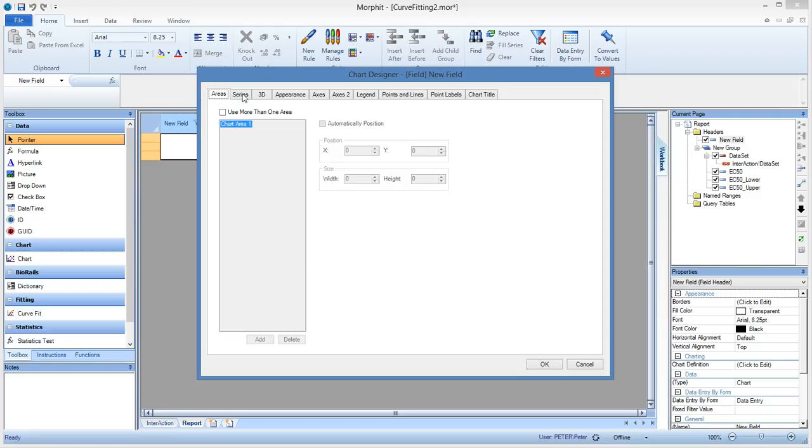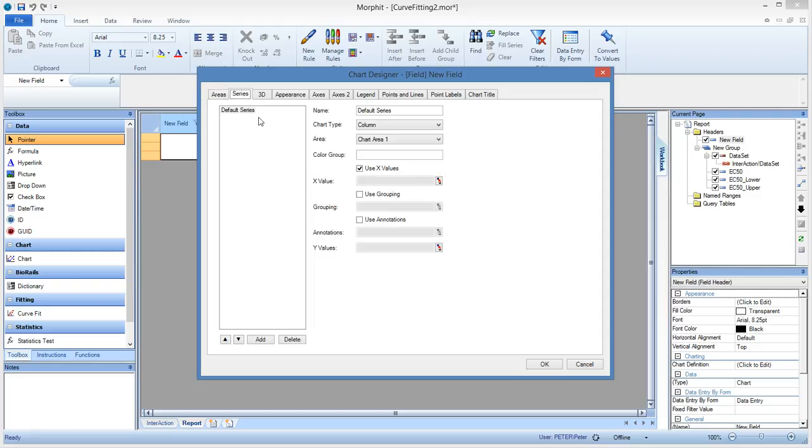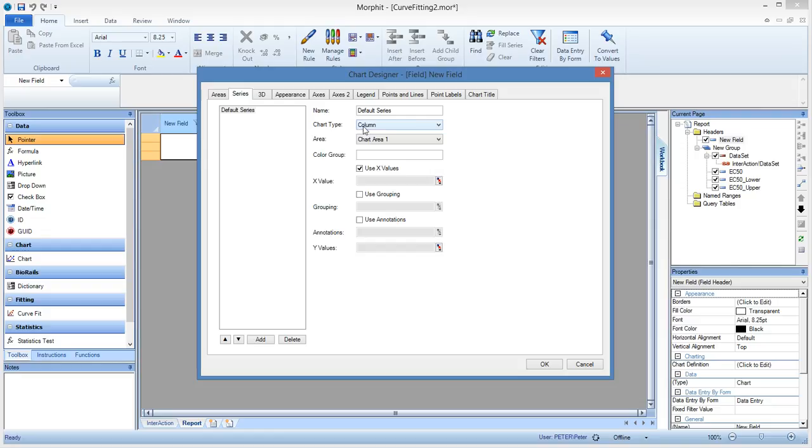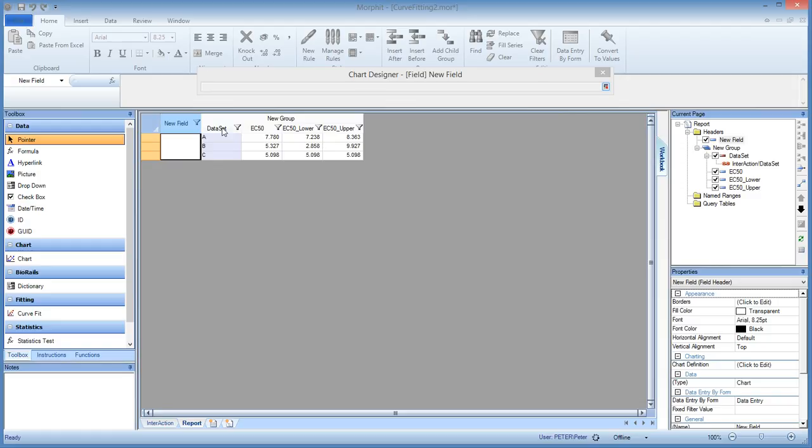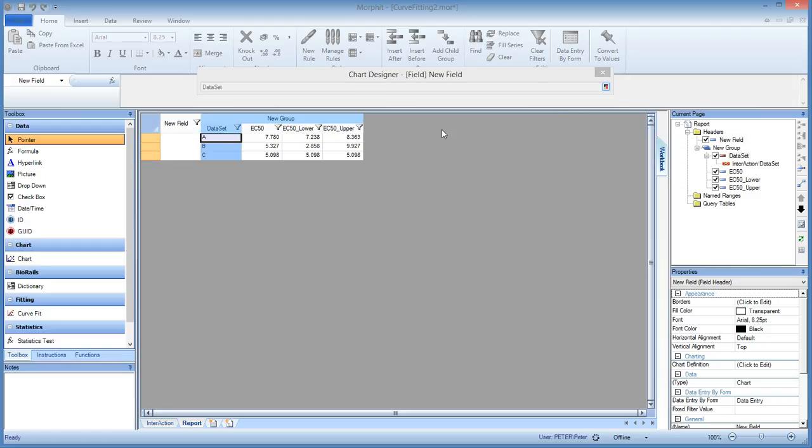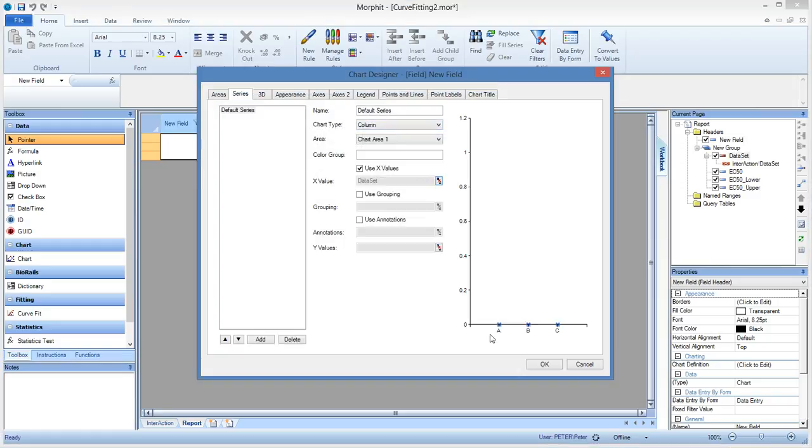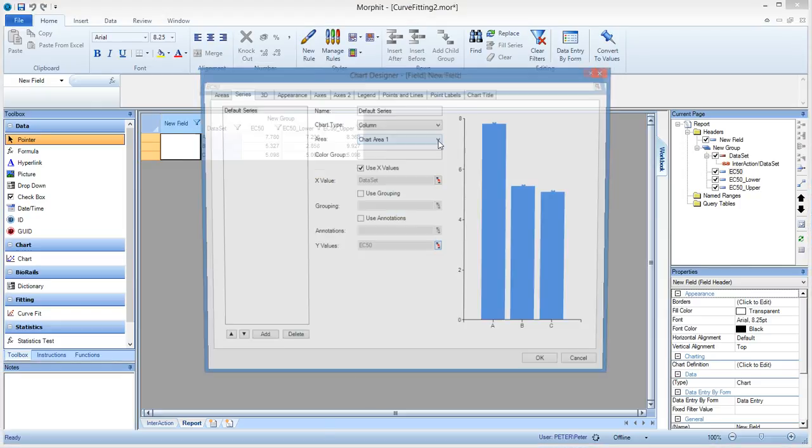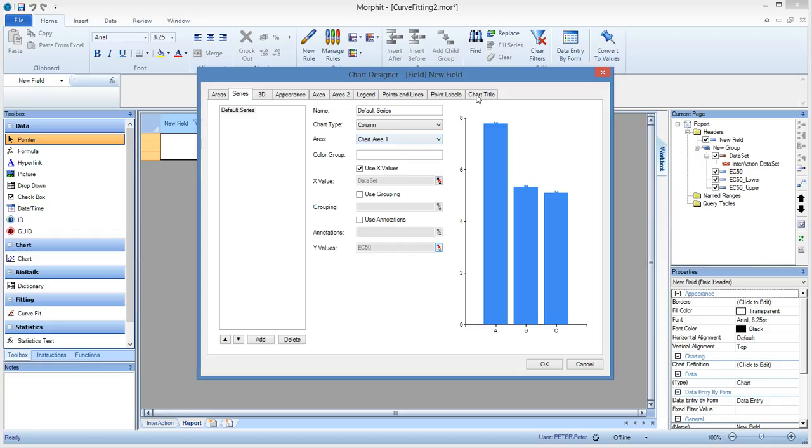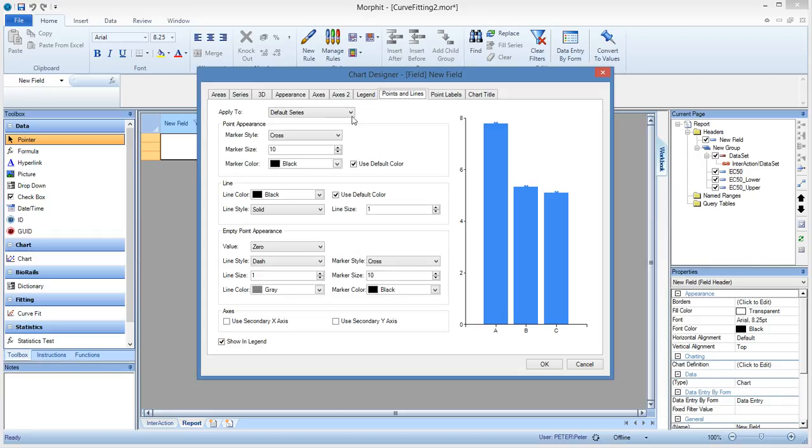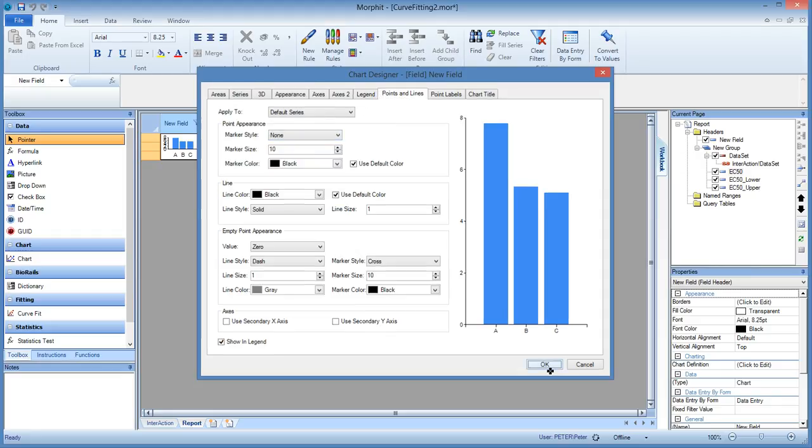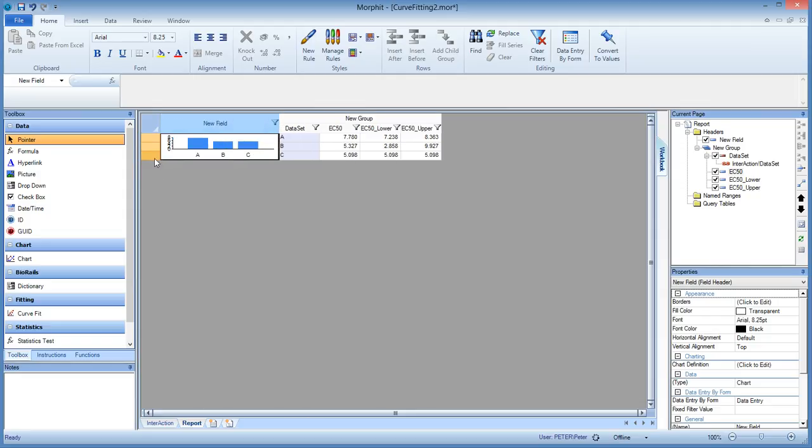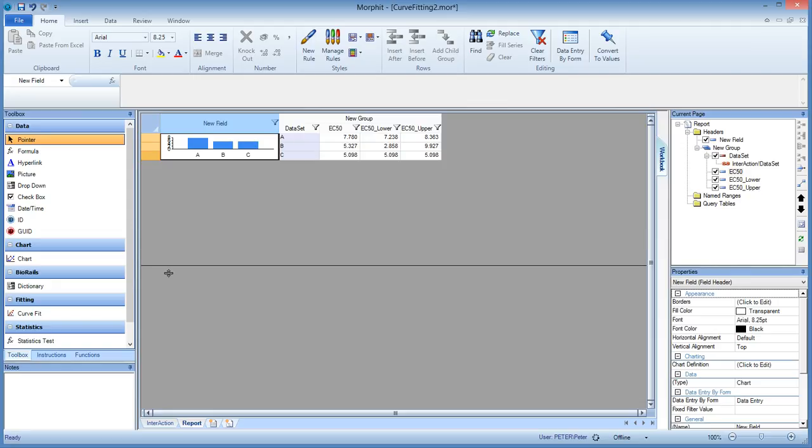And now we are going to add a series, and we make that just a column. And the column is now, with x data values, is the data set. So that is a category scale, A, B, C. And as y values, we give it the EC50. So now we have it, and we clear the point. And this brings back a chart, which is showing the three EC50 values for the three data sets. So it's a nice display, but we didn't do this for nothing. So the lower and the upper can be brought in as an error bar, or as whiskers in this bar chart. So let's do that.